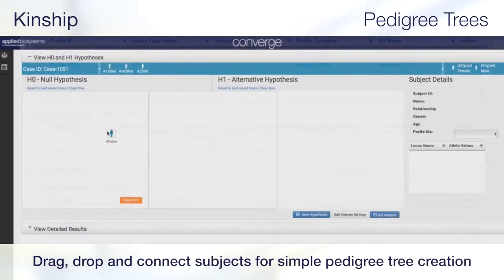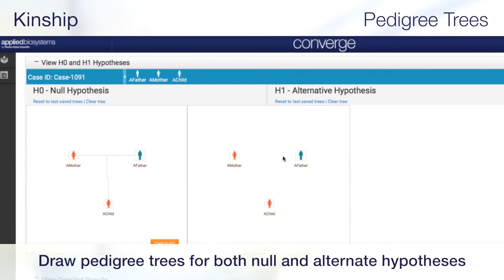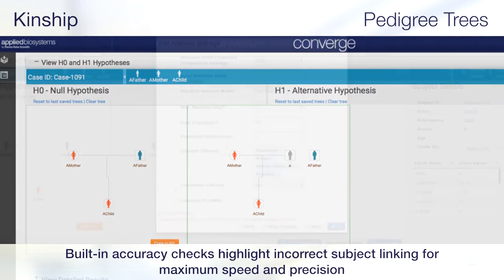Unlike other cumbersome software solutions, Converge makes creating pedigree trees simple and intuitive. Simply drag, drop, and connect various subjects quickly and easily, creating a variety of hypotheses by drawing pedigree trees for both null and alternate hypotheses. And with the software's built-in accuracy checks, Converge highlights incorrect linking of subjects for maximum speed and precision.